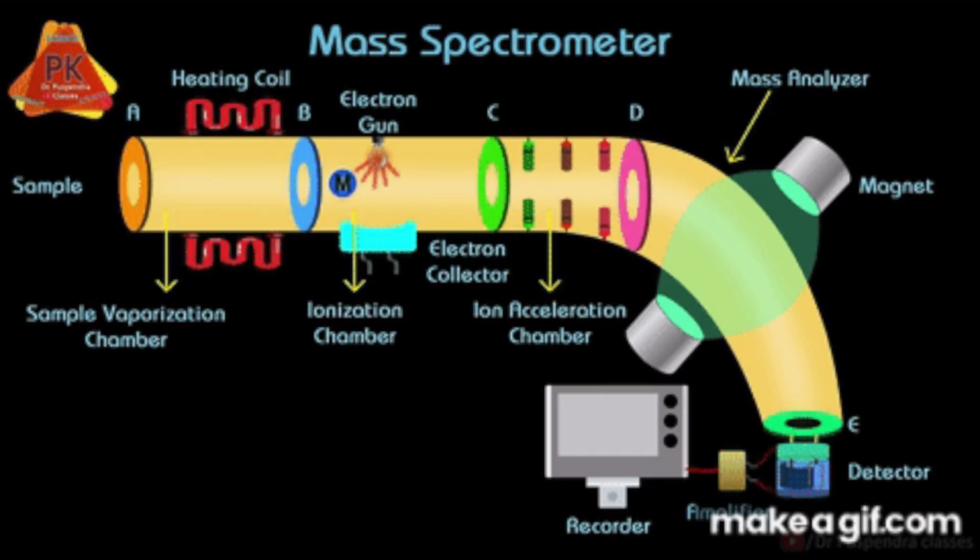So to further confirm that what I have is the real deal, we can use a mass spectrometer. I'm just gonna show a GIF here and just talk you through the steps. Essentially what happens is you take this peptide and it gets vaporized and shot out with an electron gun in the ionization chamber, which is basically trying to make this protein become charged, because proteins are majorly bulk neutral, although there are some regions that do have charge on proteins.